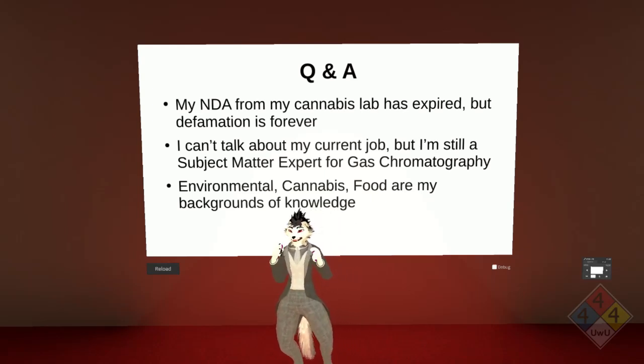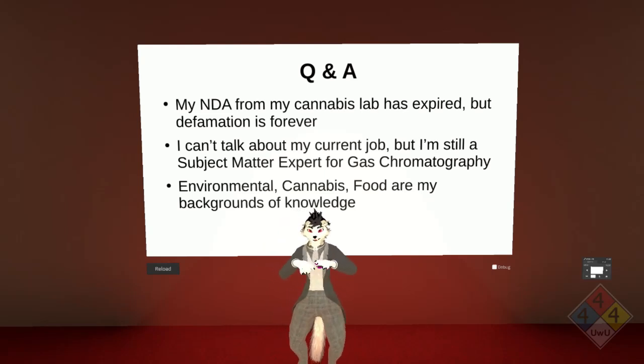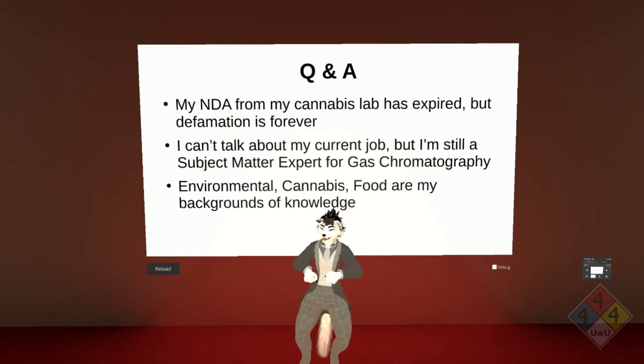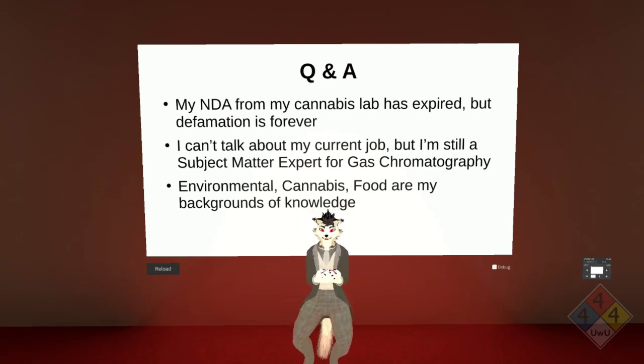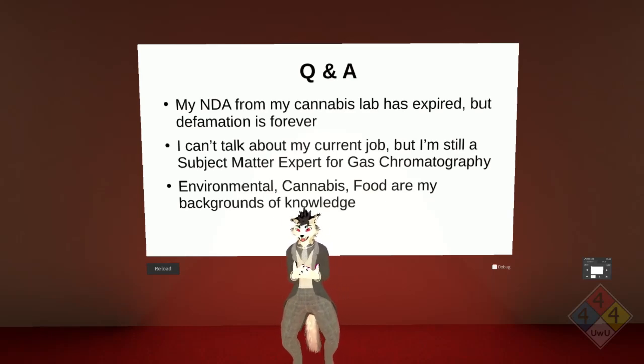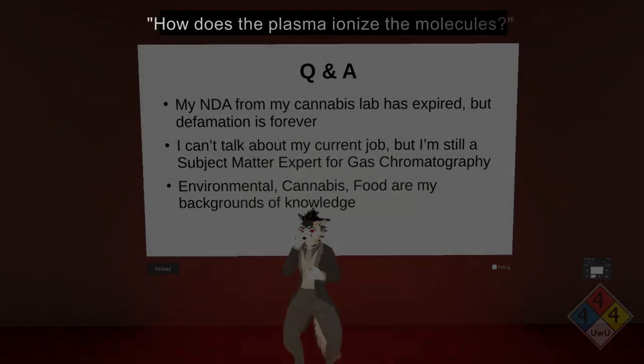And it's surprisingly, extremely sensitive this way, because when you have strong ionization, every atom that has a charge and hits the plate is introducing more of a charge than, let's say, an LC, which is using, quote, soft ionization, doing it at room temperature with mild acids. The ICP is using really harsh physics to get this material ionized and viewable by a detector.